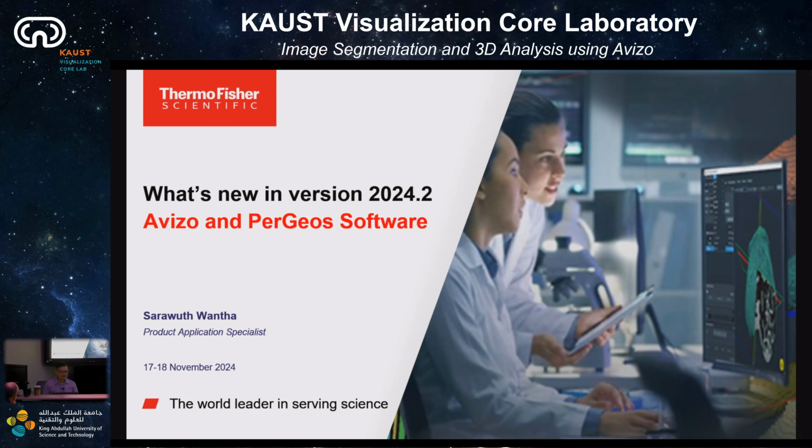So today, just big news because we just announced the end of life of PerGeos software. So now we're gonna migrate all the features in PerGeos, most of them something that's really important for the oil and gas and petroleum application, into Avizo software. And so I'm gonna guide you through how we're gonna look at the software, what changes, and in terms of application, it's going to be easier for you to use the software.